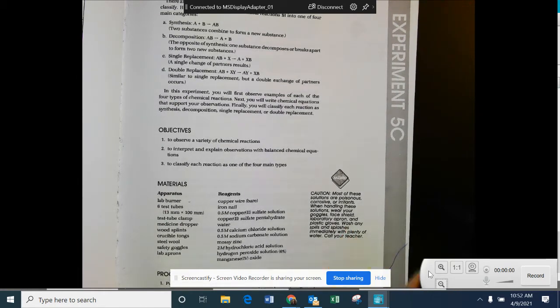Most of the things we're working with on Monday are going to be poisonous, corrosive, or irritating. None of it is going to kill you if it gets on your skin, but some of it could be harmful if you ingest it. So we're going to be very, very careful about making sure that we handle things appropriately and that we clean things up well and are wearing proper protective equipment.